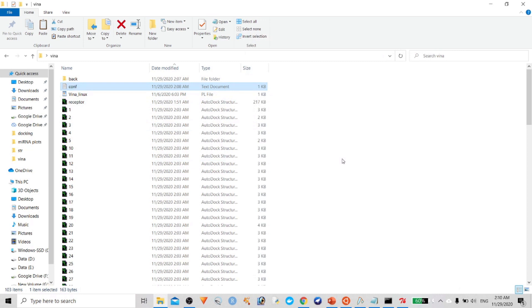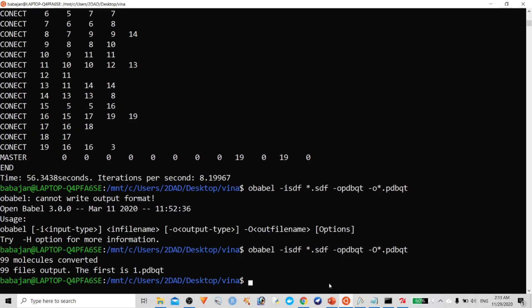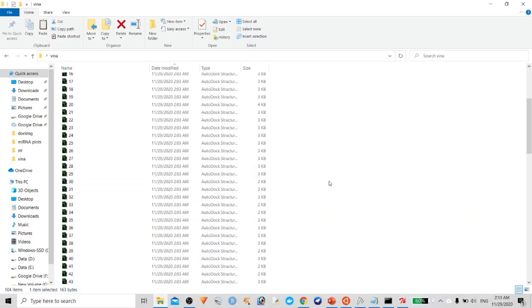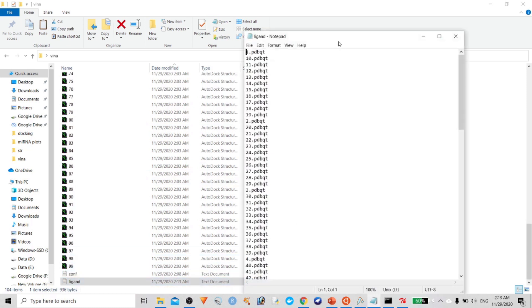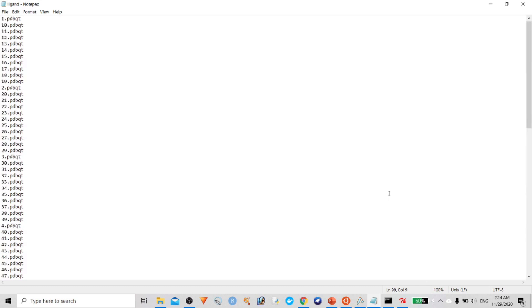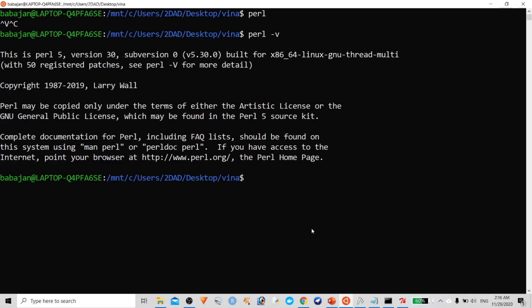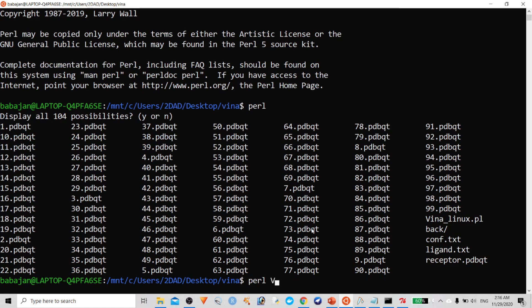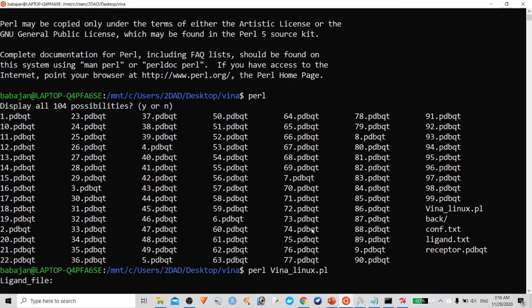Now it's time to run the actual docking analysis. First, save all ligand file names into one text file: ls *.pdbqt > ligand.txt. Then clean up the list to keep only ligand molecule names, removing the receptor file entry. After preparing the ligand list, run the docking using a Perl script: perl vina_run.pl ligand.txt.